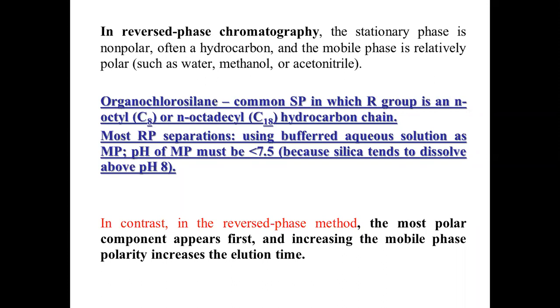So it is uncommon, untrivial to say that. If you go to the pharma industry, 90% of the pharmaceutical industry will be utilizing this RP-HPLC principle. Most RP separations are going to utilize a polar mobile phase, and these polar mobile phases will be adjusted to a required pH. And what should be the pH then?